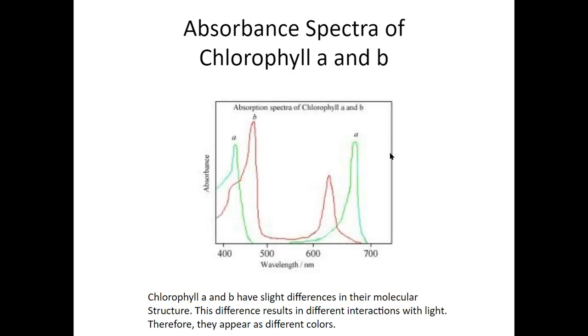Okay, the next thing is an example from the book, absorbance spectra of chlorophyll A and B. And this, again, is something you can do too. It's really good to extract the chlorophyll out of leaves. I had a couple of gals do this over the years where they would look at leaf senescence, the aging of leaves, and how that affects the chlorophyll content, and how to use certain plant hormones to reinvigorate the plant.